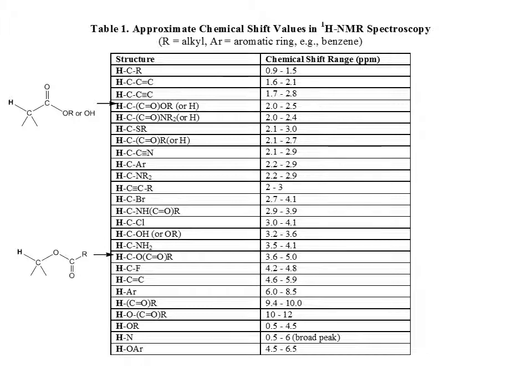And finally, in our third example, we have H attached to Ar, and Ar is not argon. Okay? Ar is a benzene ring. It's a symbol for benzene. And that has a chemical shift between 6.0 and 8.5. The H to Ar chemical shift range is extremely valuable for figuring out molecular structure, so you want to pay attention to that one quite a bit.